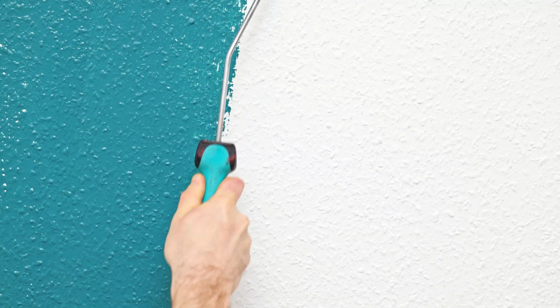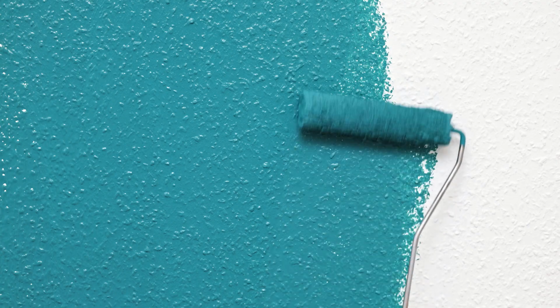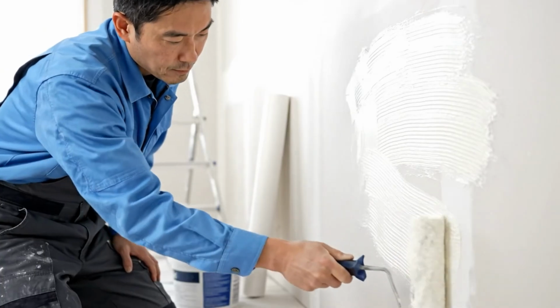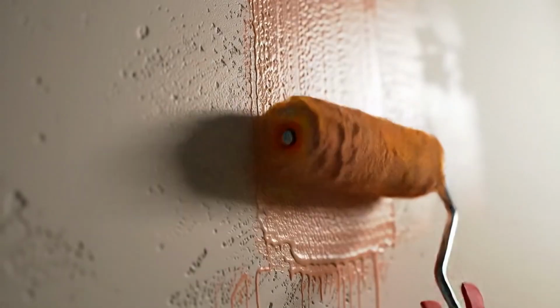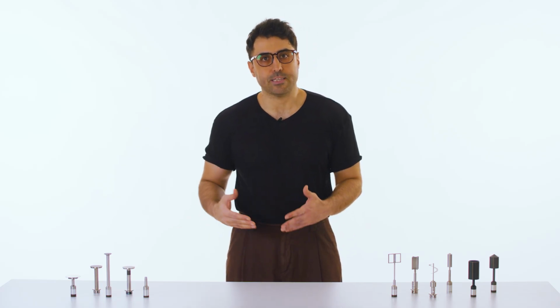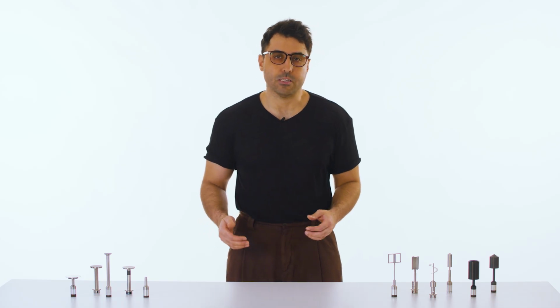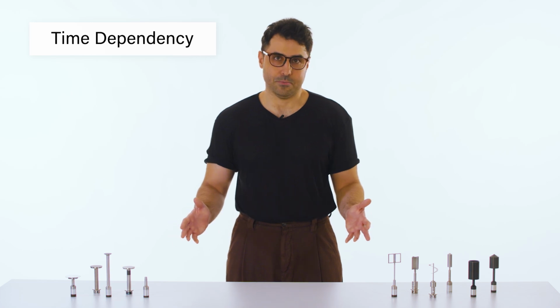When you roll it onto a wall, you want it to thin out just enough to spread smoothly, but you don't want it to rebuild too fast, or you'll get brush marks. And you don't want it to rebuild too slowly, or it will sag and drip down the wall. This delicate balance, how fast the material breaks down under stress, and how fast it rebuilds when the stress is removed, is what we call time dependency.